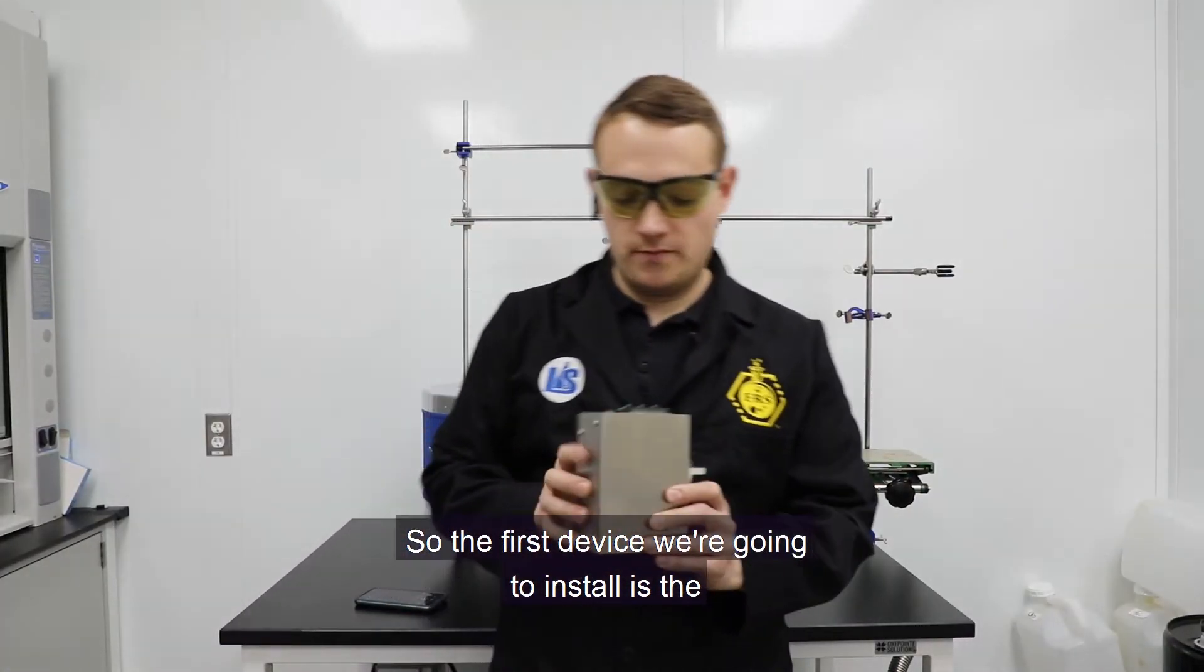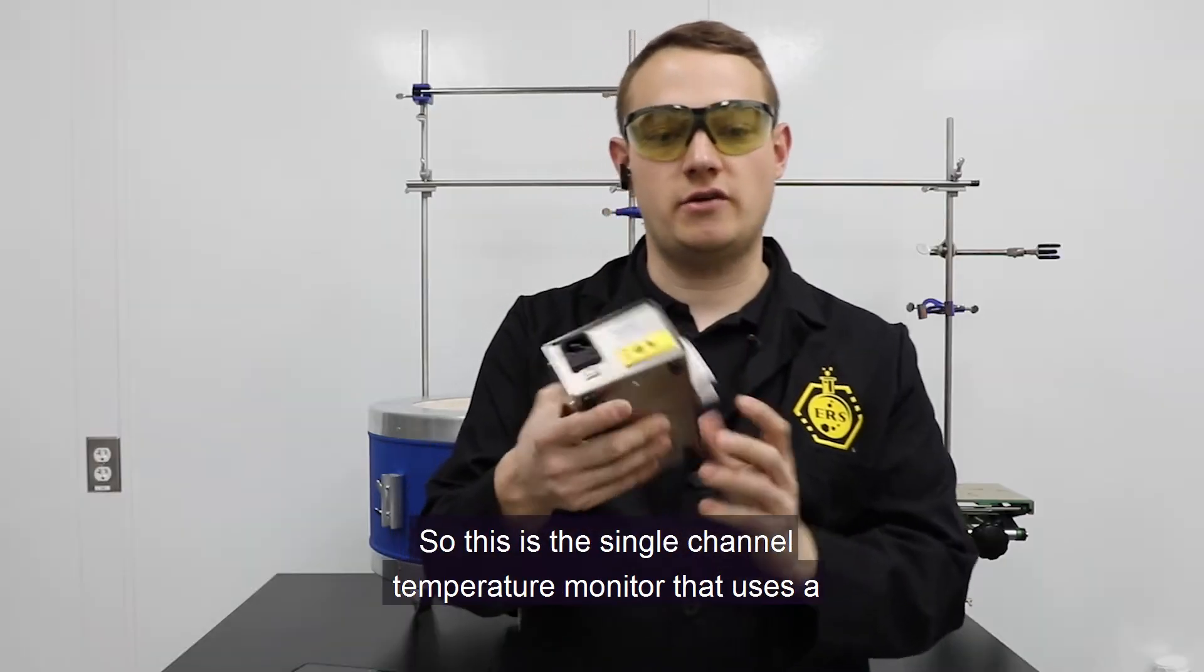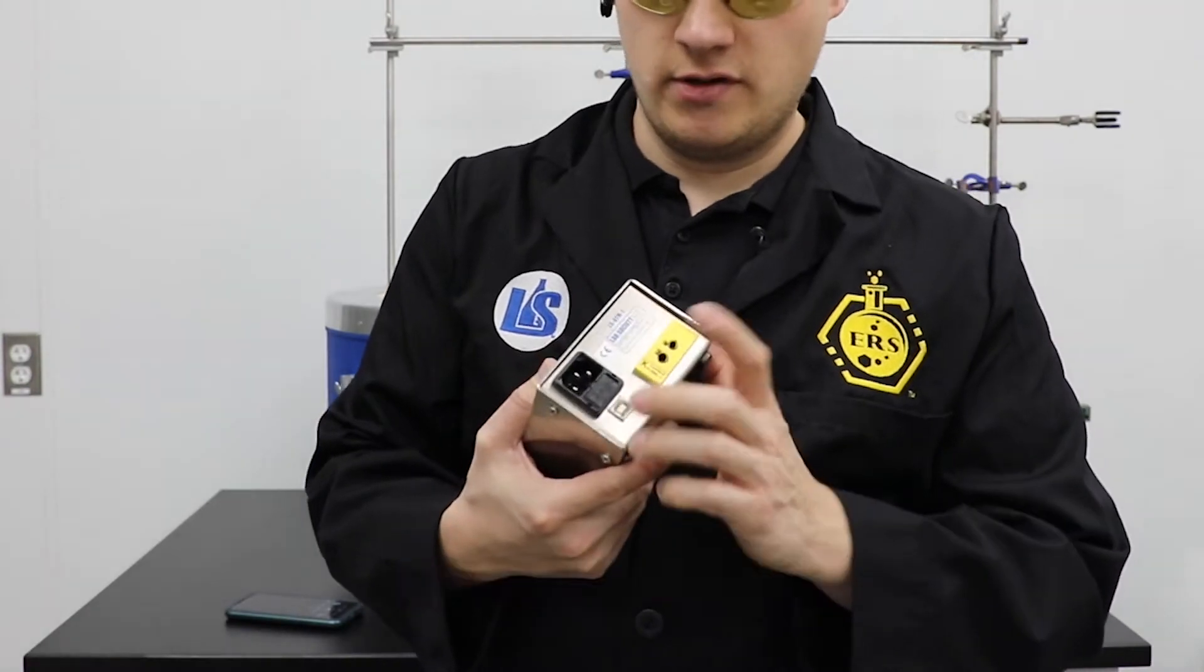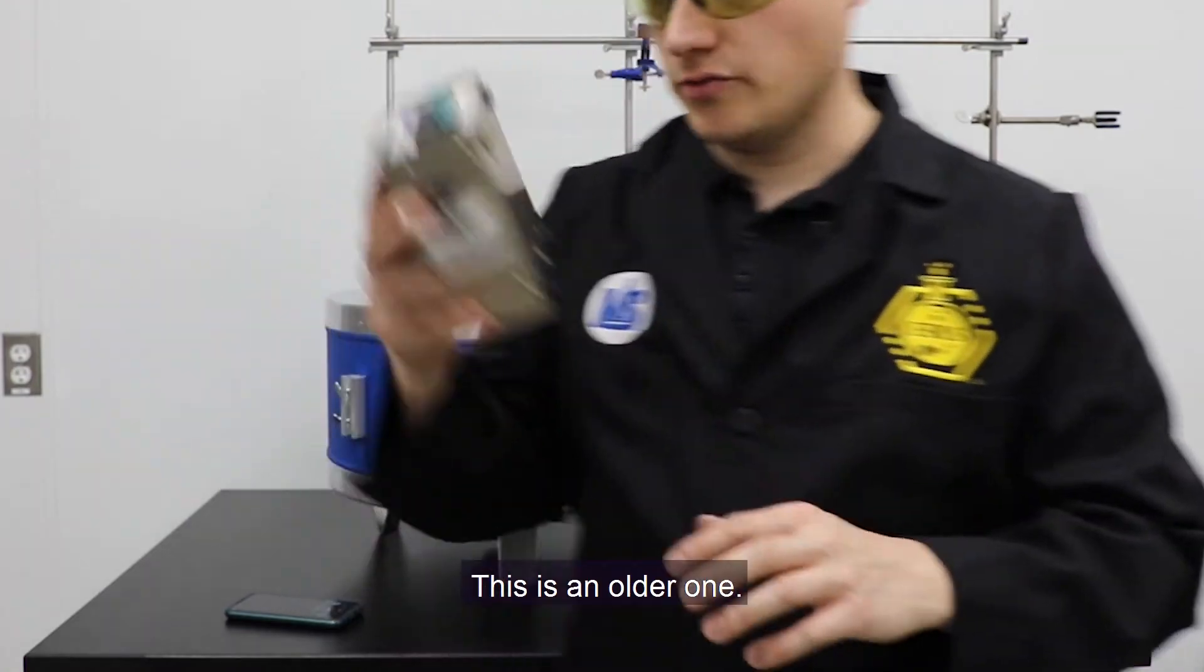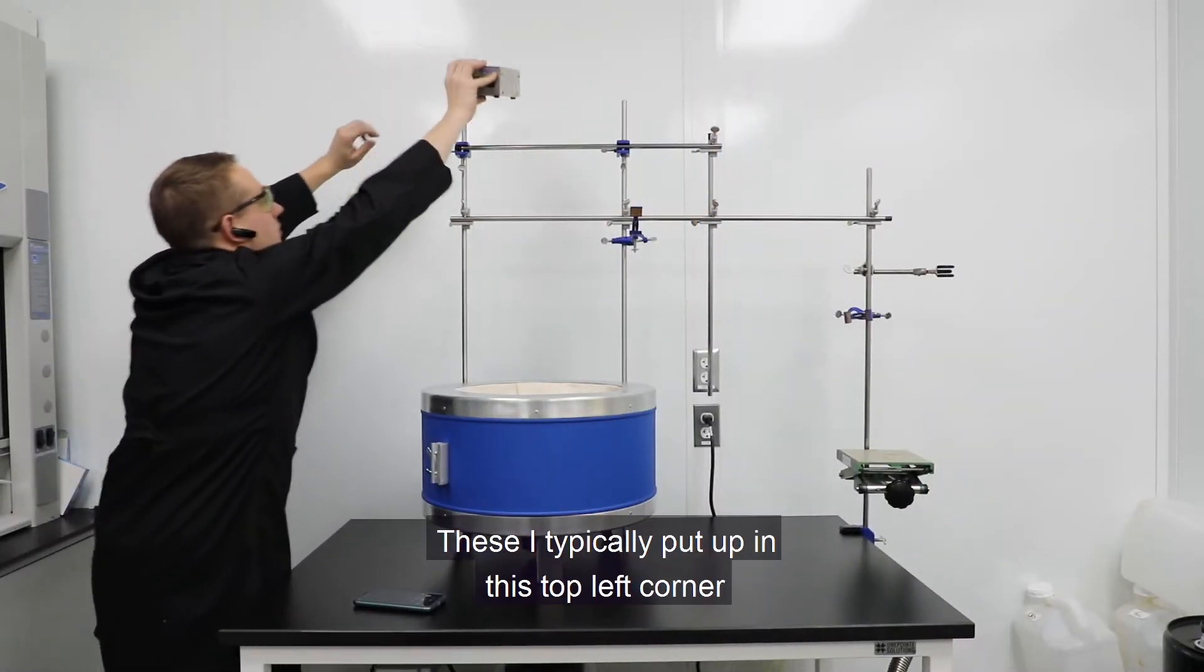So the first device we're going to install is the DTM-1 temperature monitor. This is a single channel temperature monitor that uses a K-type input, has USB output, and our newer models have an external power supply for UL compliance. This is an older one. These I typically put up in this top left corner.